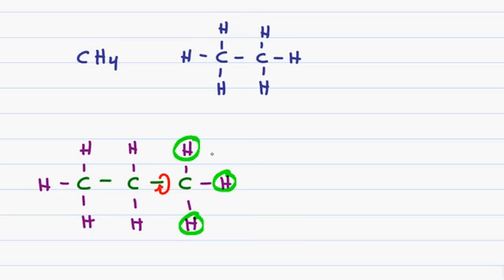However, notice that this molecule has a plane of symmetry so that the carbon on the right is essentially the same as the carbon on the left, making the 3 terminal hydrogens on either side the same. This gives me 1 type of hydrogen. And then I have 2 hydrogens on the central carbon. However, these are different from the terminal hydrogen based on the fact that they are located on a secondary carbon, while the terminal hydrogens are located on a primary carbon.